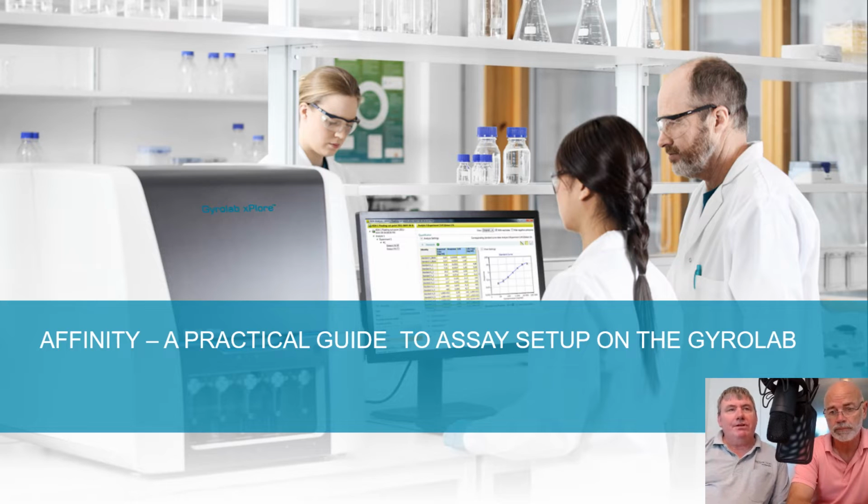Yeah, this episode really is aimed at bioanalytical scientists who aren't that familiar with affinity or haven't really had a background doing something like BIAcore or SPR, and to show them how they can utilize the system and actually get really good affinity data. It's a real advantage of the platform that you can generate this data, and it can be a very useful application, particularly when you want to characterize reagents or look at the binding of your analyte, etc. So it's a very useful aspect of the system.